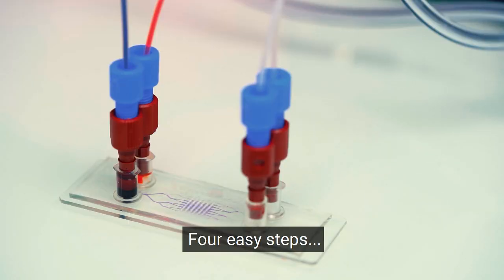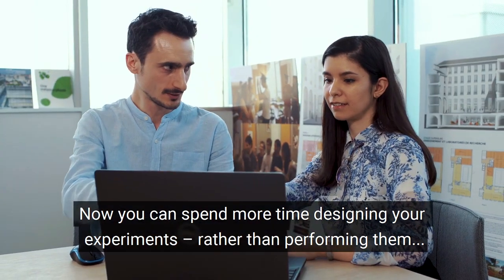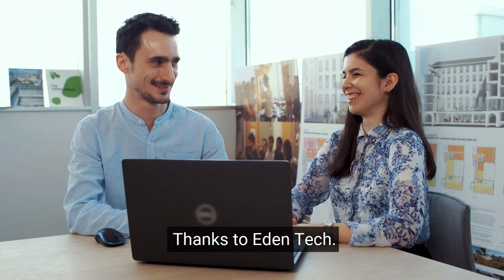Four easy steps. Done. Now you can spend more time designing your experiments rather than performing them. Thanks to Eden Tech.